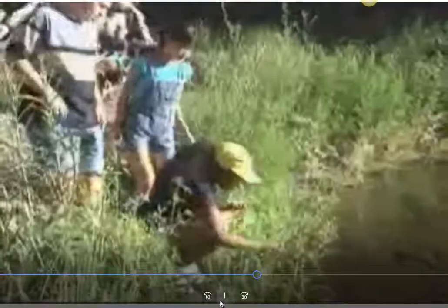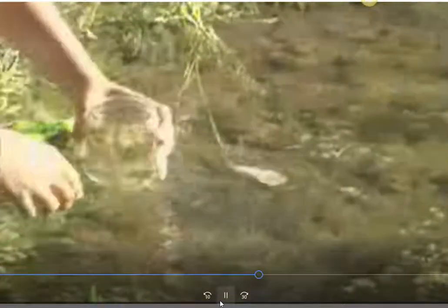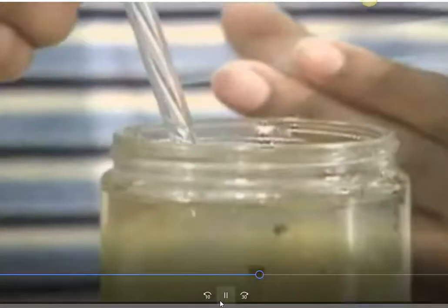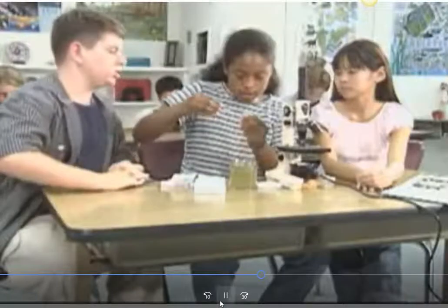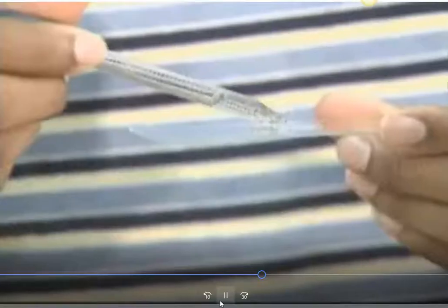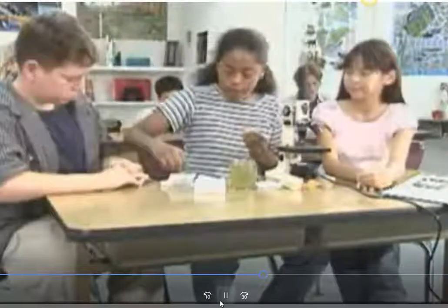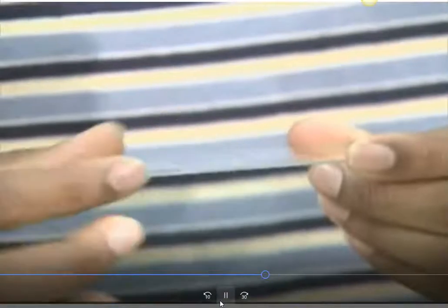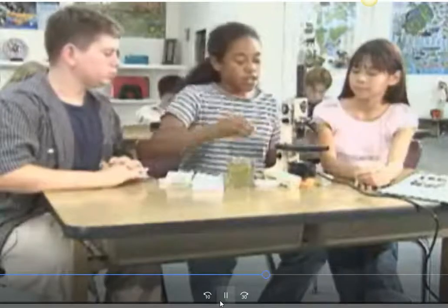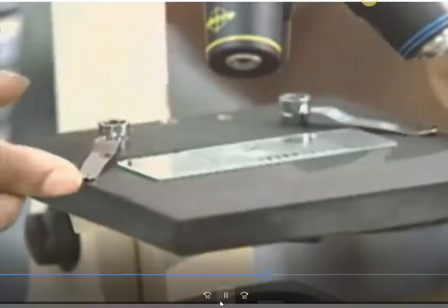These students are about to discover that some of the best specimens can be found at a local pond. Back in the classroom, an eyedropper is used to deposit a drop of water onto a glass slide. What do you cover it with? A cover slip. The slide is then covered with a cover slip. It is then placed on a microscope stage beneath two clips.